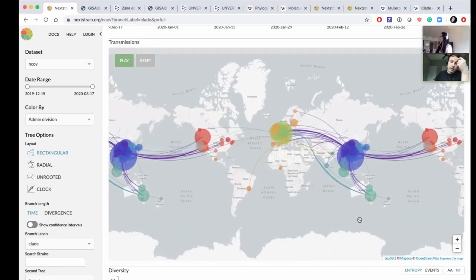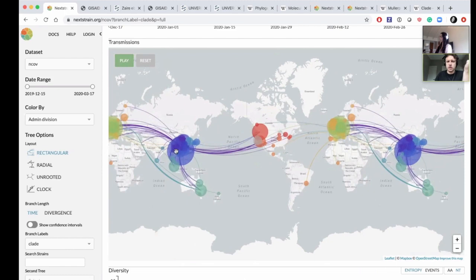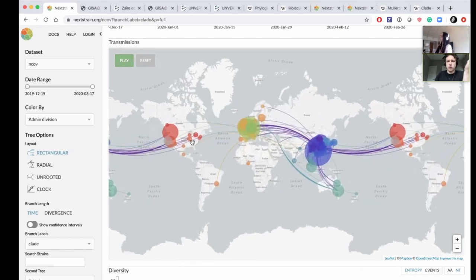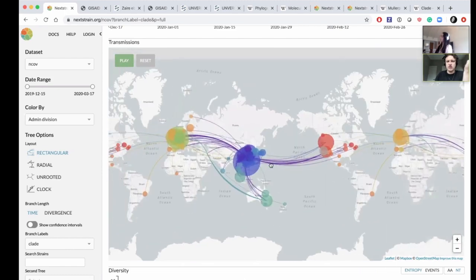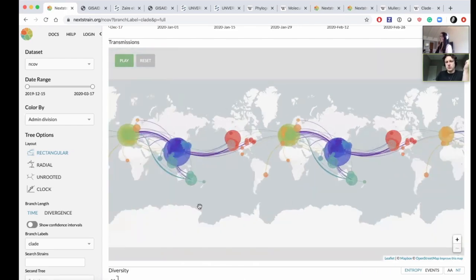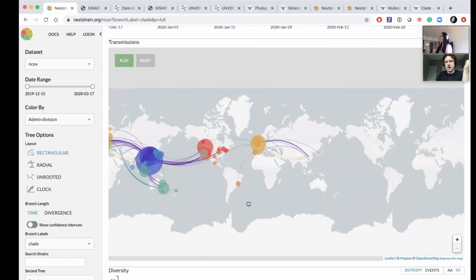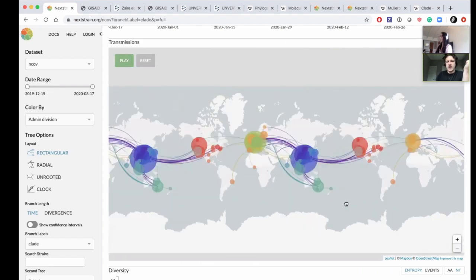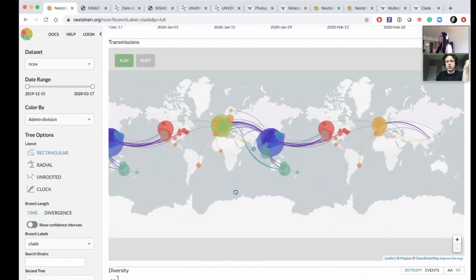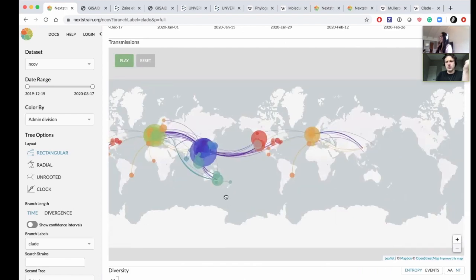Now we do double it. You can see that it's doubled. So that if you're looking at the U.S., if you want it to be U.S. centric, you can still see China and Europe. And if you want it to be Europe centric, you can still see U.S. and China. So we duplicate. If you zoom out, you can see the tree is duplicated and then stops, and then duplicated and then stops. Oh wow! Okay. So that's that. It's basically two full and then a half.